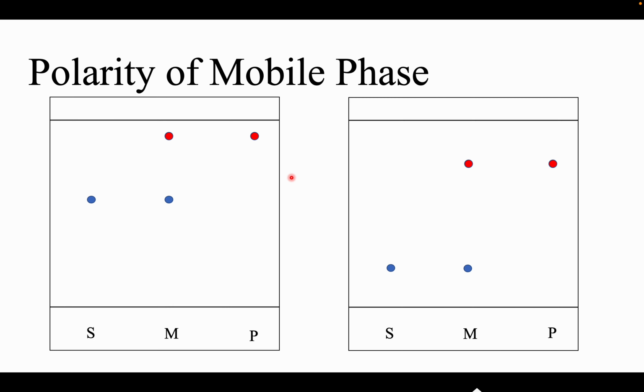on silica. Lastly, the polarity of the solvent will also determine how a molecule / spot moves on a plate. More polar solvents will cause the spots to move farther up the TLC plate, as seen here, while less polar solvents will lead to less movement up the TLC plate, seen here.